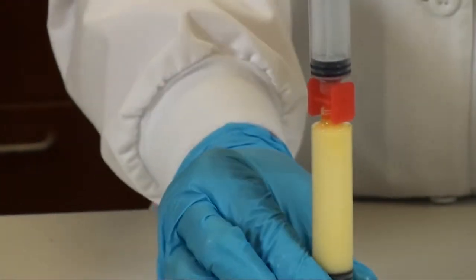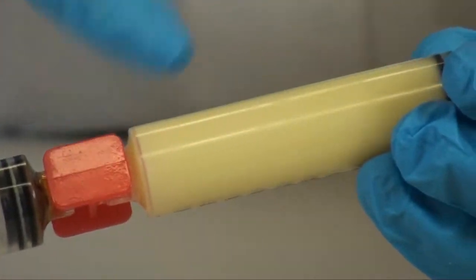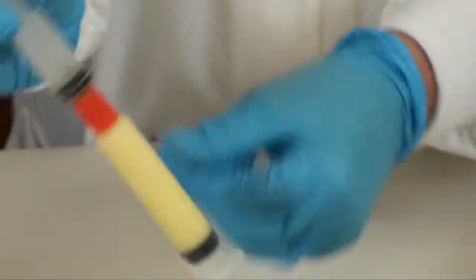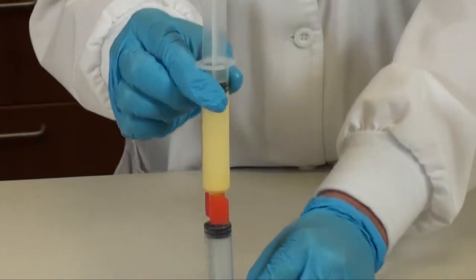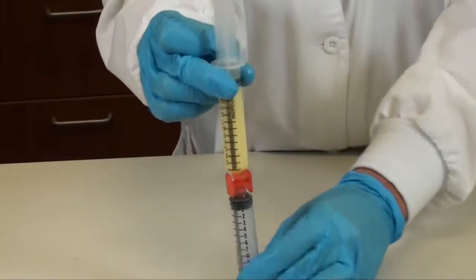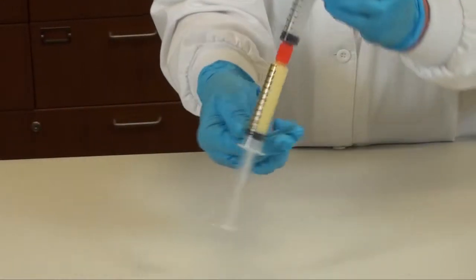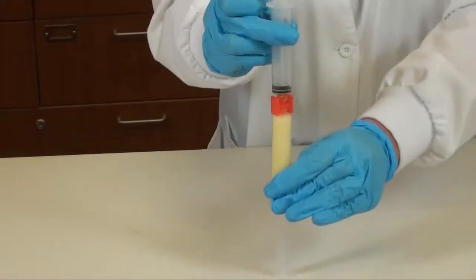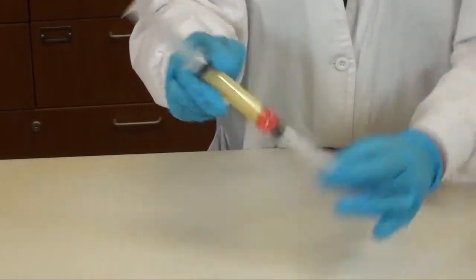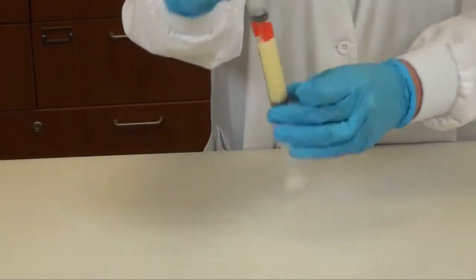You will want to check periodically for any dark yellow swirls because that means that the PLO gel is not uniformly mixed yet. Keep doing this and I recommend that you, if you want to count, it's probably about 50 times.